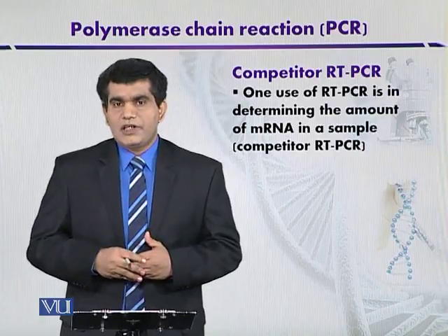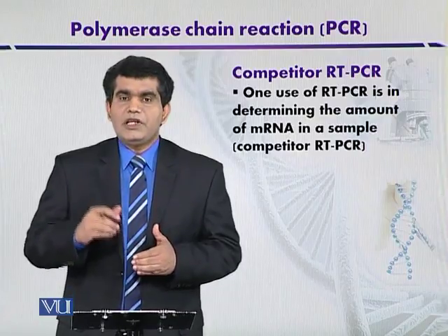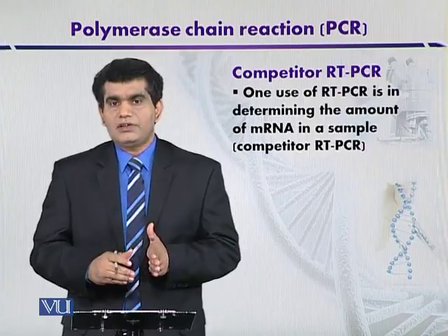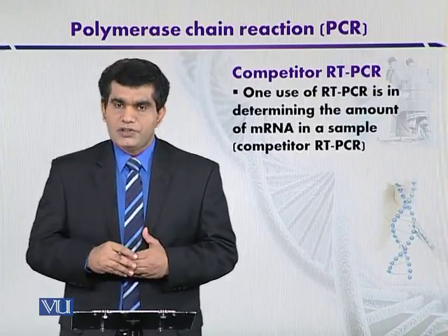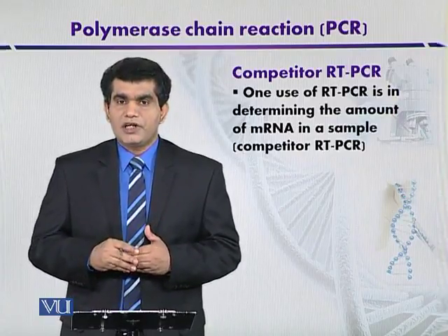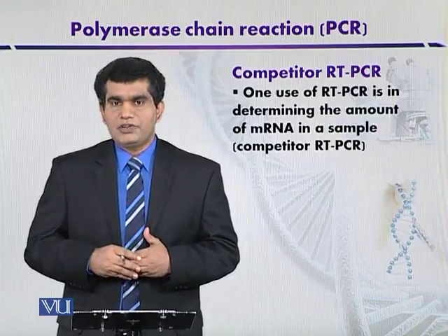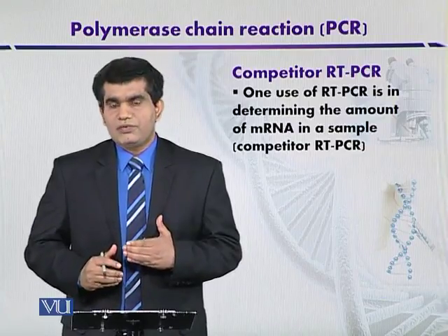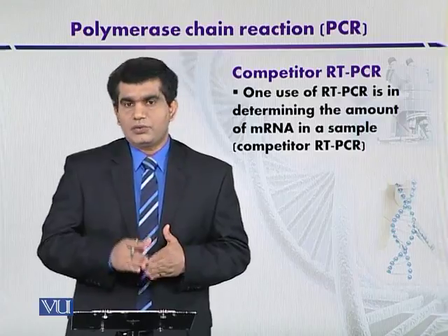Another application is that we can determine whether certain inhibitors are present during the extraction process or in the reaction mixture when we are going to conduct the PCR. These may be endogenous sorts of RNA inhibitors, or exogenous ones.